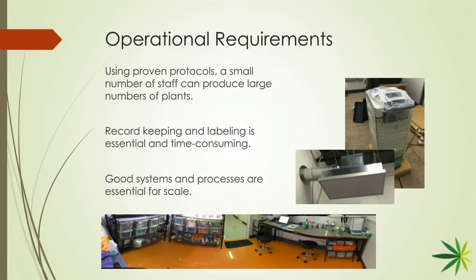Well, I often tell people that this process isn't magic, but actually this is where the magic is. You have to have a good laboratory manager. You have to have a good process. Basically, any operational competence that you have to maintain a large-scale facility, you've got to apply it here. You have to have record-keeping and labeling practices. You've got to have inspection schedules. Time to sit and baby 5 or 6 individual cultures. You've got to deal with, ideally, thousands if you're doing it right.